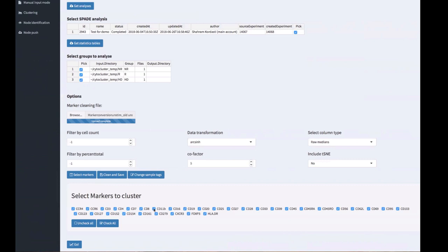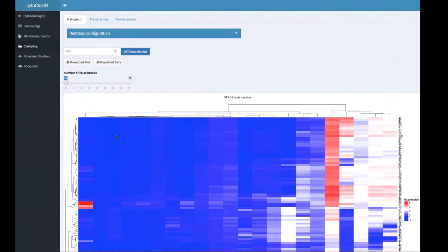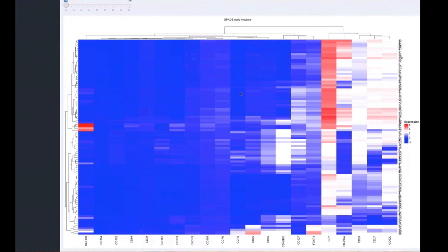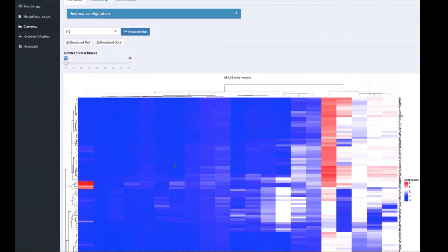Since our data are already gated, we will exclude some markers that are not very meaningful for this particular example. After selecting the markers we want to cluster on, pressing 'go' takes us to the second step of the Cytocluster workflow: selecting the main group to analyze. We select the healthy donors, and by pressing 'generate plot,' we create the population heat map — where each column is a marker's expression and the rows represent SPADE nodes from the SPADE experiment run in Cytobank.